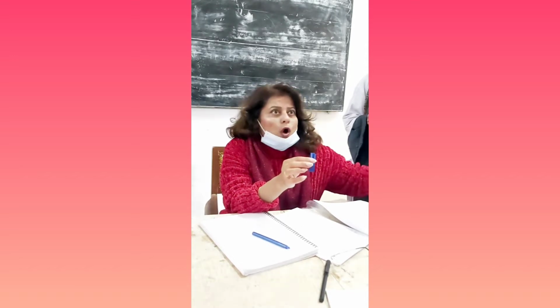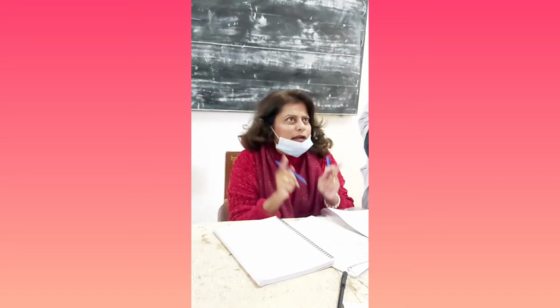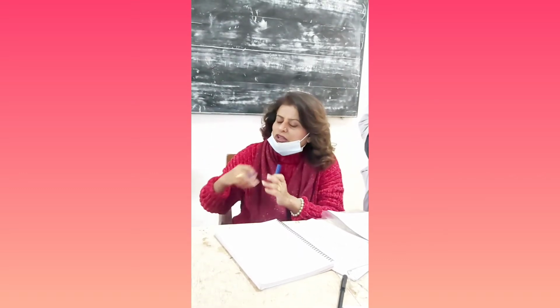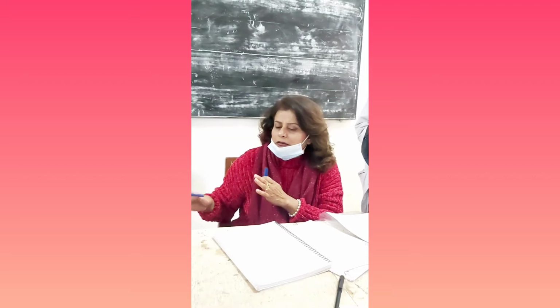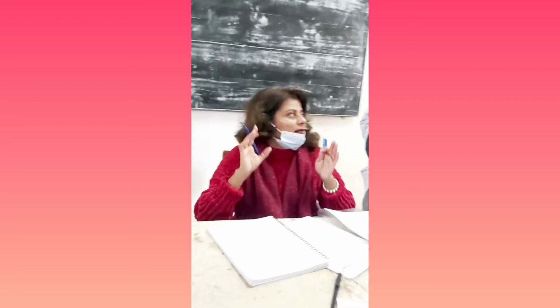It will become black because of the carbons, a lot of carbons, and your sodium extract would be colored, and we don't want colored sodium extract. Keep that in your mind. No colored sodium extract. Sodium extract should be colorless, and if you have a colored compound, just throw it away and make it again. Go through all the steps again, and keep in mind that sodium extract is always colorless.